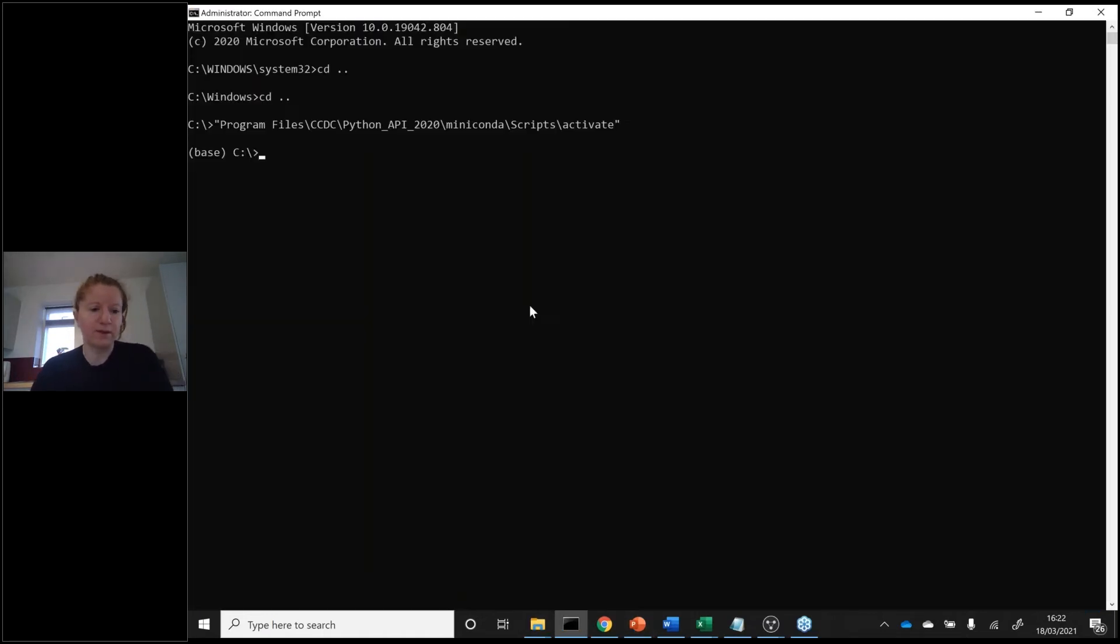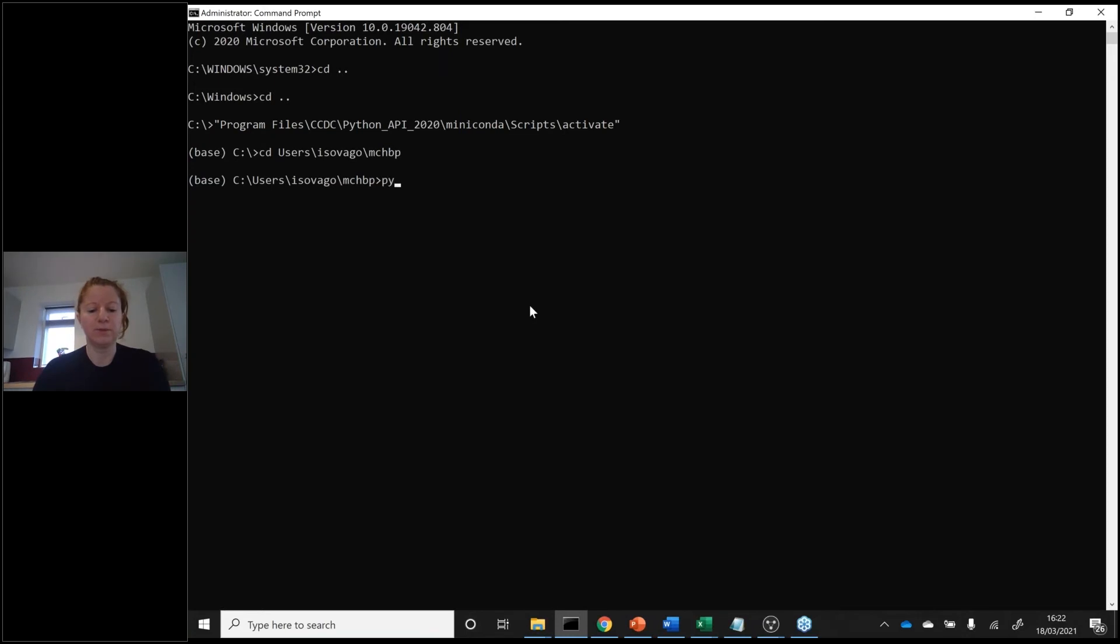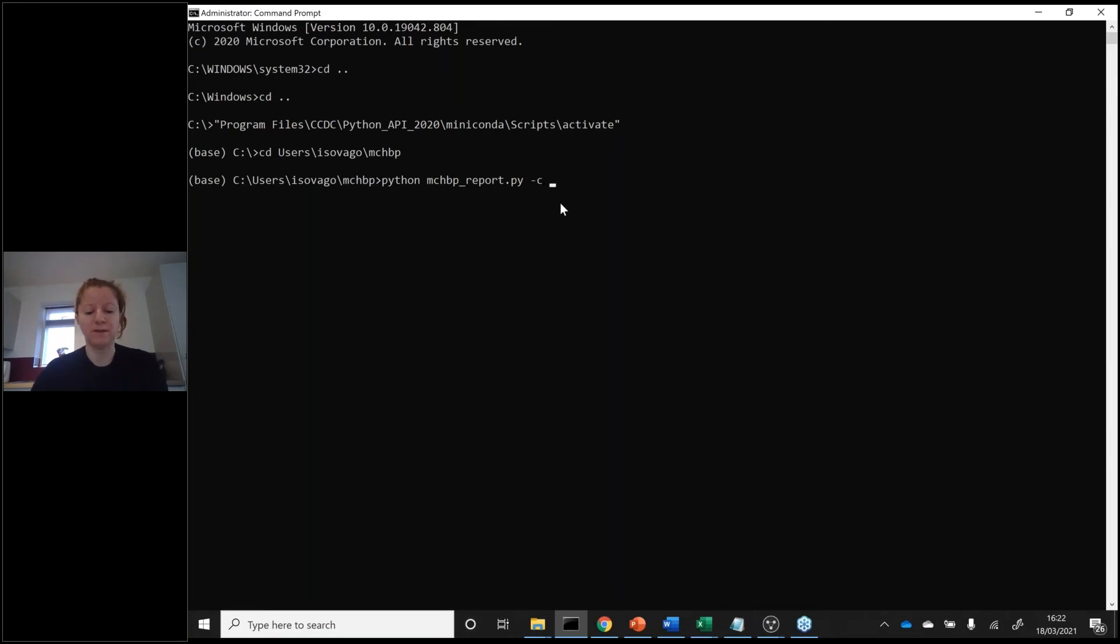To just run this script, let's go in that folder. Then you call Python, then the Python script which is called MCHBP_report, then minus C, and then you call the conformer library folder.